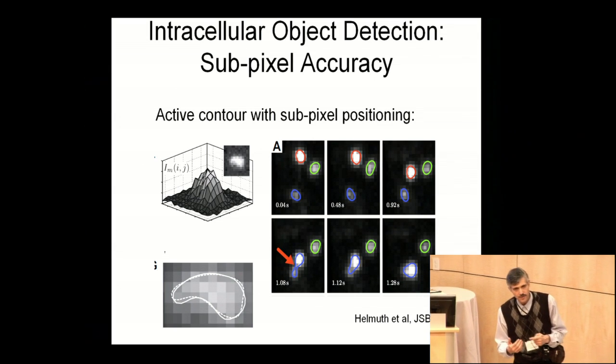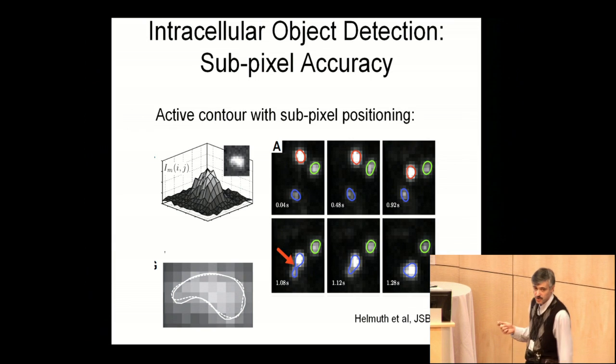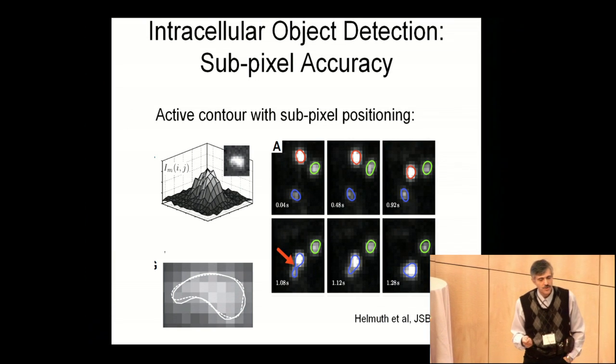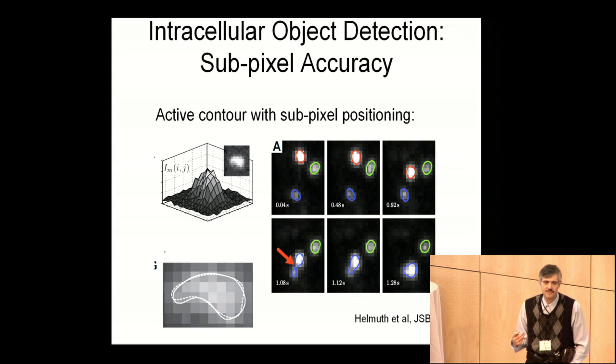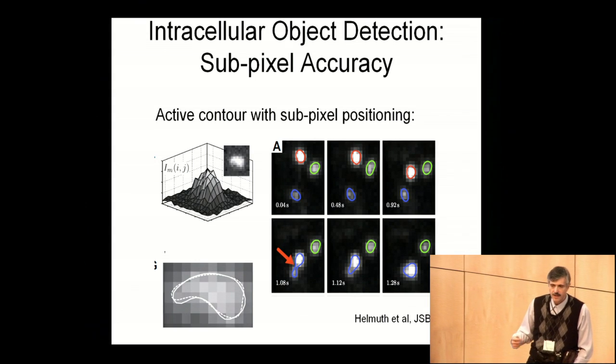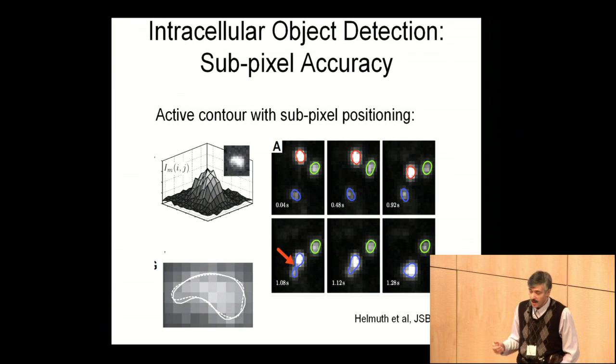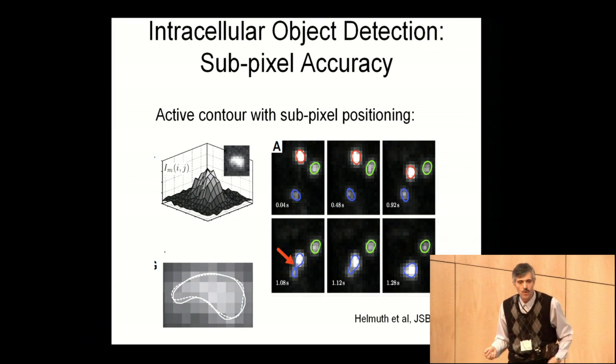And there is an external force produced from the original image. Generally, this approach is used on images which are not pixelated, where you don't feel the pixels yet. In this case, you can easily calculate external forces, like intensity or gradient, on the original image. Then you allow this contour to evolve until it stays at some point when all forces are balanced.